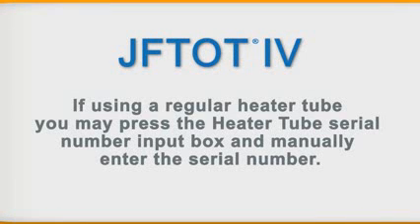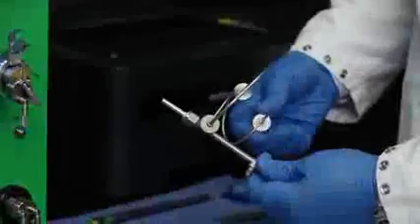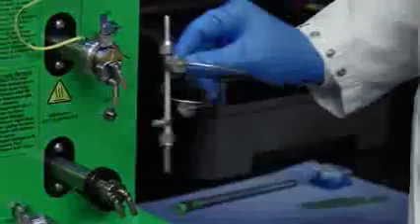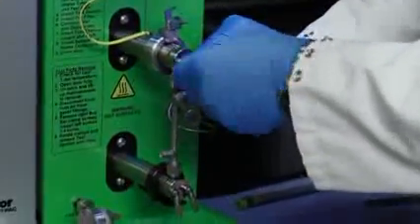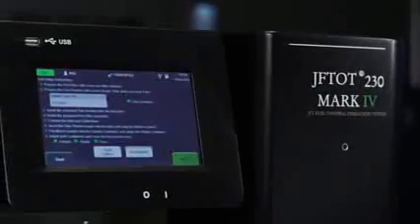If using a regular heater tube, you may press the heater tube serial number input box and manually enter the serial number. Otherwise, continue with installing the test components. Do a quick inspection of the test section assembly.